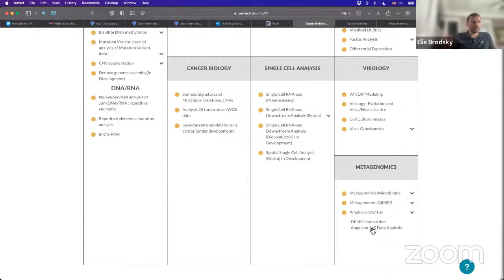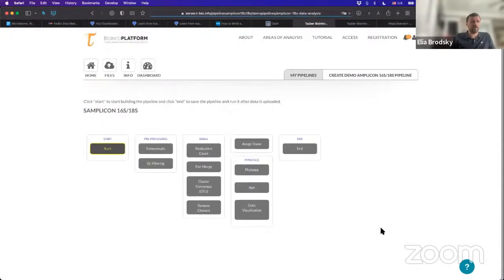This link right here will give us access to a demo. In the demo, we can build a pipeline without having to upload data and right away get results, so we don't have to wait for the processing time either.